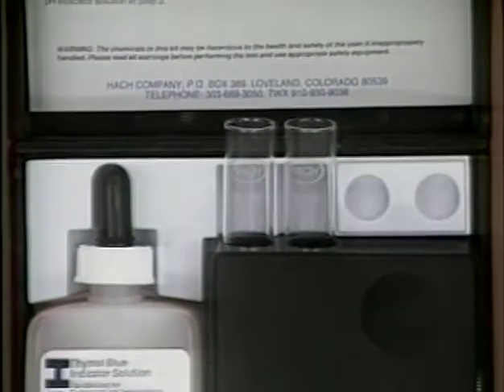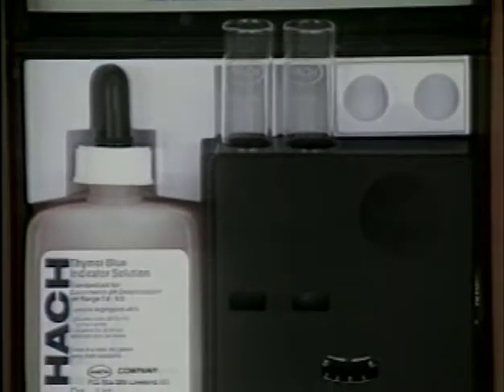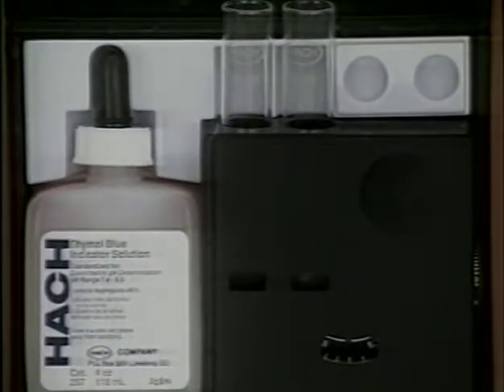Narrow-range test kits are not included in most large kits and must be purchased separately. It is important to remember to first check your pH using the wide-range method and then, if greater accuracy is desired, use the narrow range test. To test the pH using the narrow range method, proceed as follows.